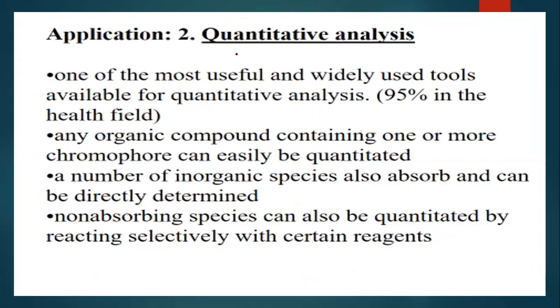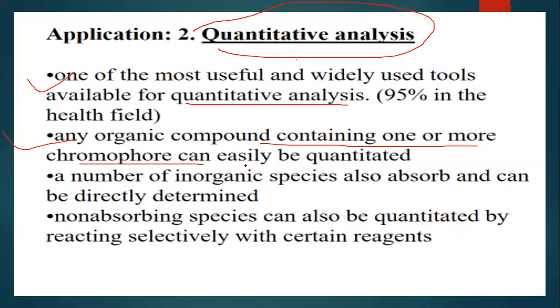Now, quantitative analysis. How can we use it? It is one of the most useful and widely used tools available for quantitative analysis, and it gives very precise analysis. You are finding the concentration. Any organic compound containing one or more chromophores can easily be quantitated or studied.